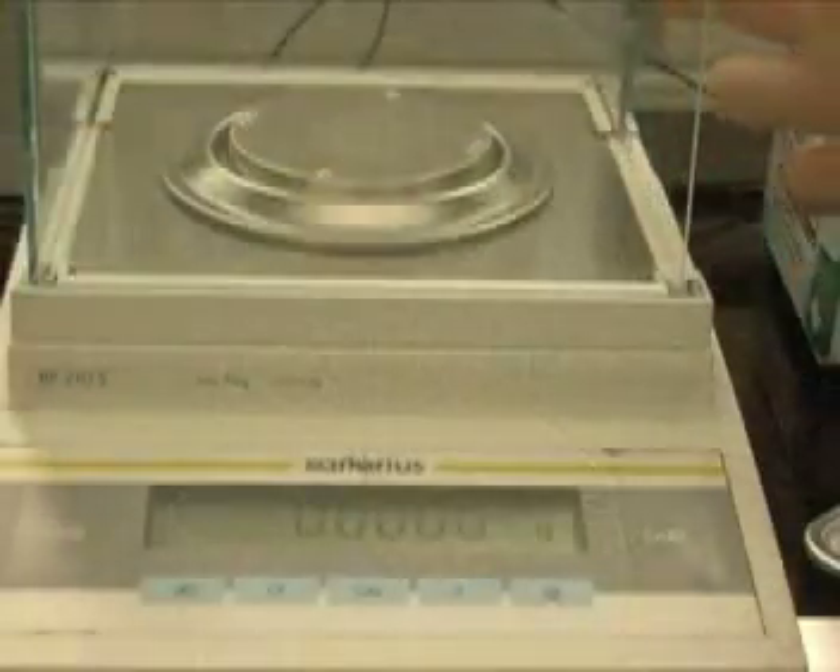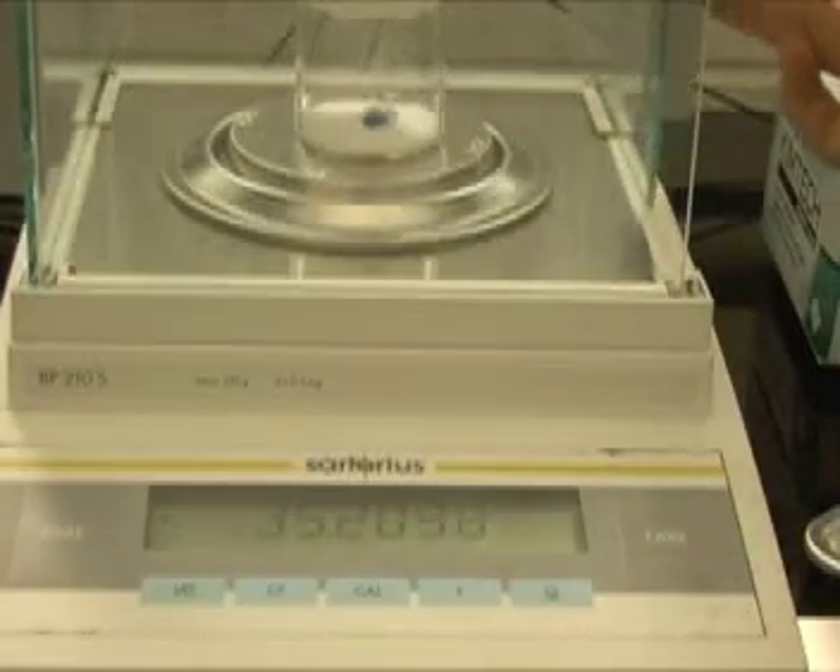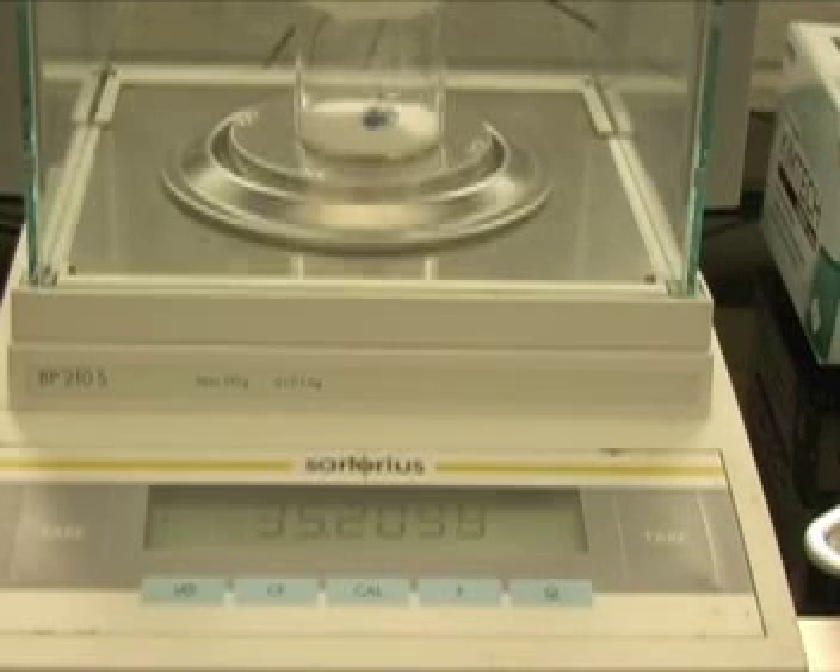When your weighing bottle is placed on the analytical balance, you must wait for the balance to stabilize. If the balance displays the same value for 5 seconds without changing, this mass can be recorded.